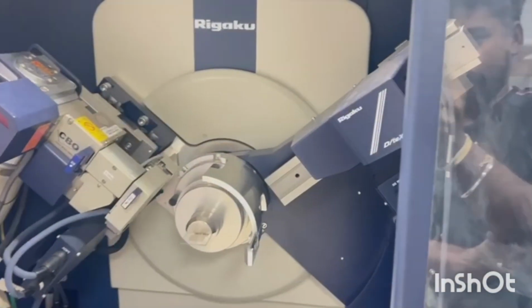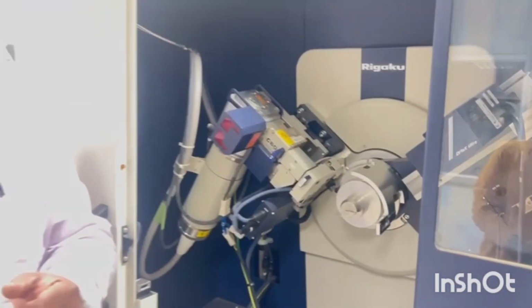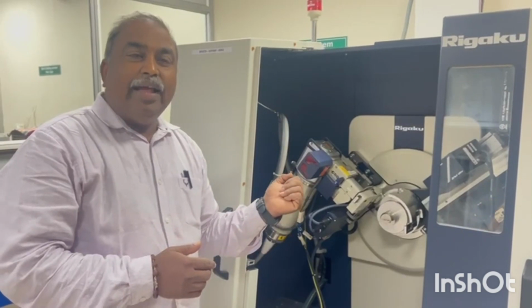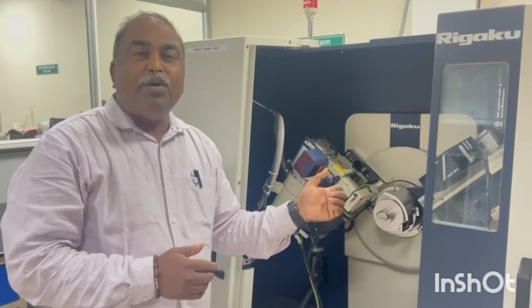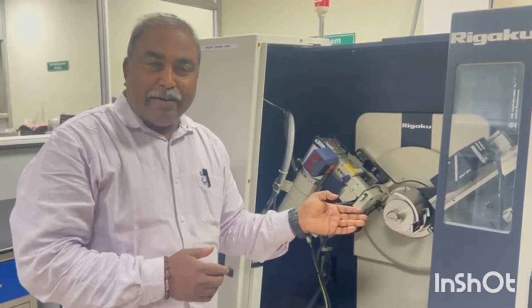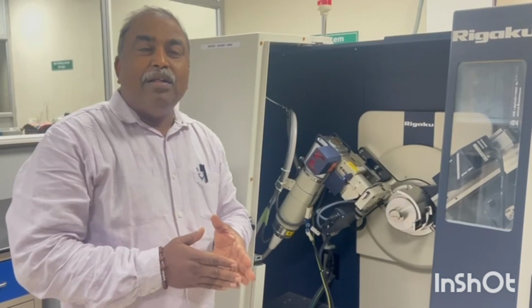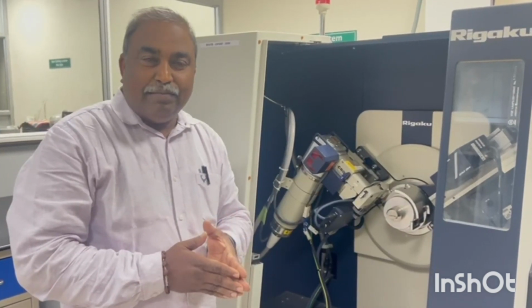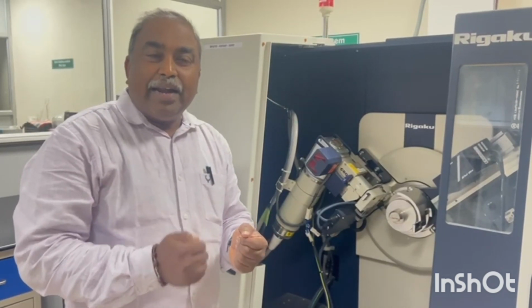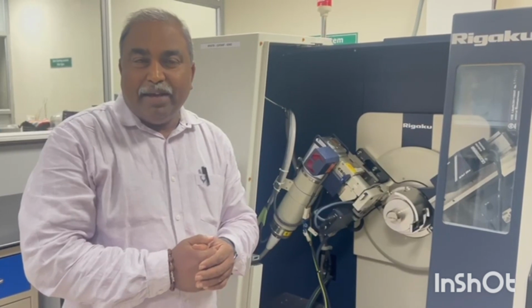There is a very important mechanism here, which is the goniometer. What is a goniometer? It is a mechanism that maintains the X-ray tube as well as the detector at a particular angle. Okay, we have theta-theta as well as theta-2theta goniometer. So it's a very simple, non-destructive technique through which you can get the D-spacing, from which you get what the material is by matching this diffraction pattern against the ICDD database.